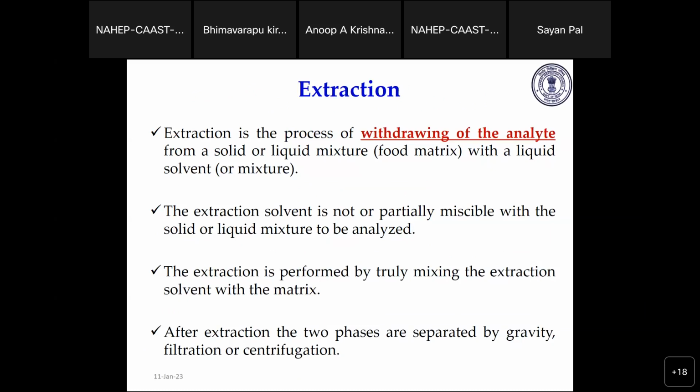You need to extract that particular analyte, an antibiotic or an antimicrobial compound, from that tissue, which is bound with the tissue, remove it into a solvent medium, and from there we do different types of miscibilities or associated extractions, so that there will be a differentiation between the actual analyte and the interferences.